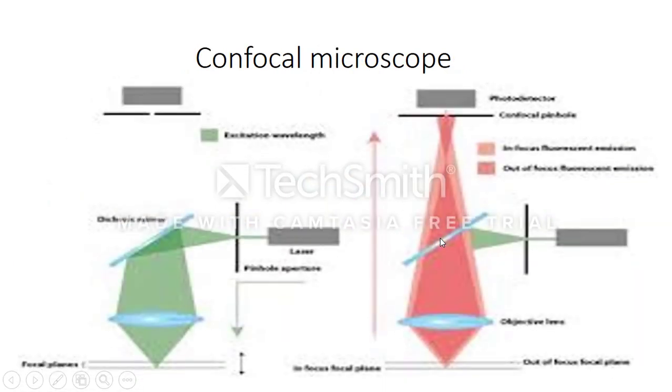So now we're going to take a look at confocal microscopes. The light beam here is very, very intense. We use a laser here, and it's directed through a pinhole to focus the light onto a certain part of the cell, considered confocality. So it goes through this process, and it hits the cell at one specific point.